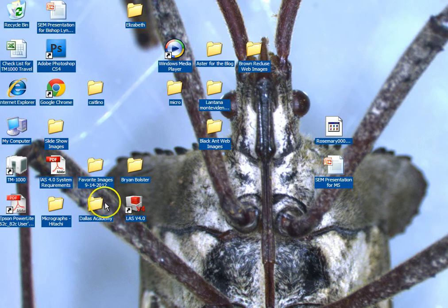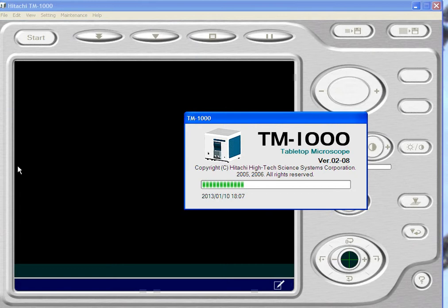Now we want to start the program. We're going to click on this icon right here — it has the same name as the scope, it's TM1000. I'm going to double click on that, and when I do, the program should open. It takes a second, and there it is.